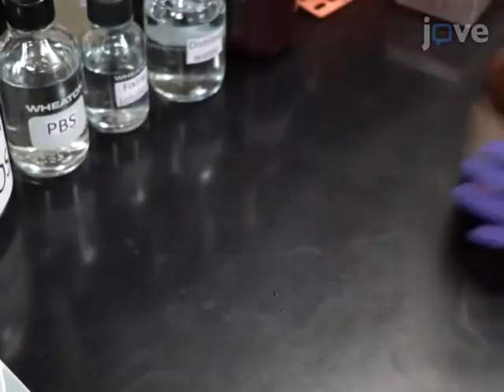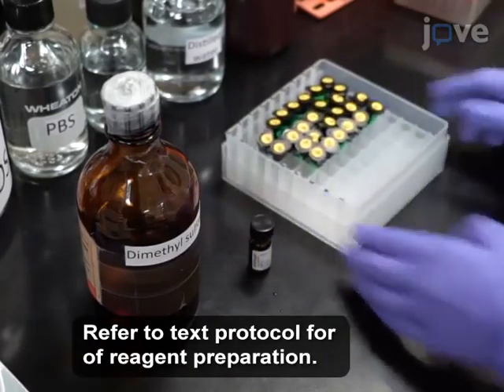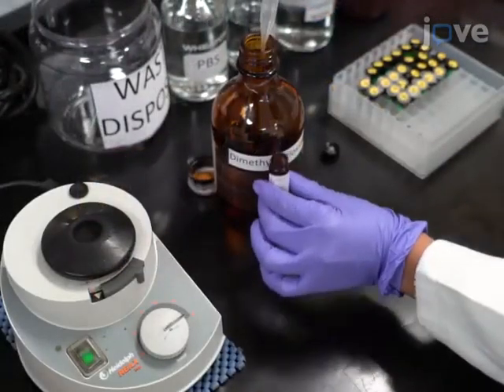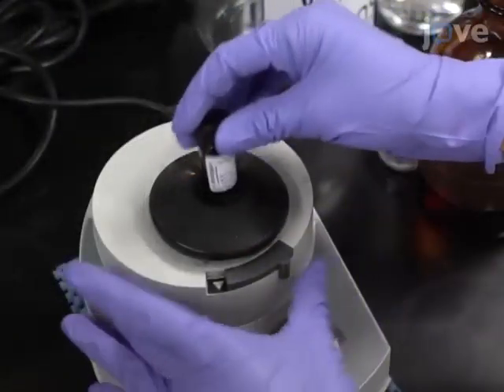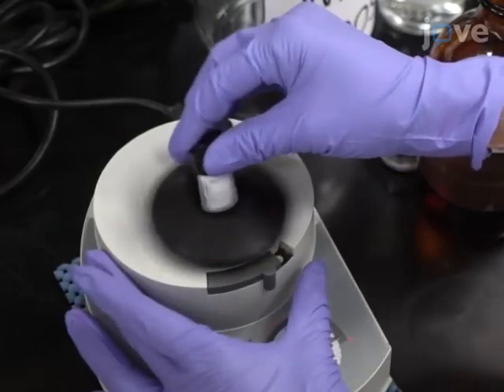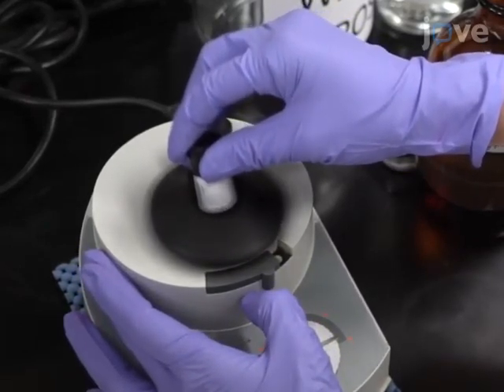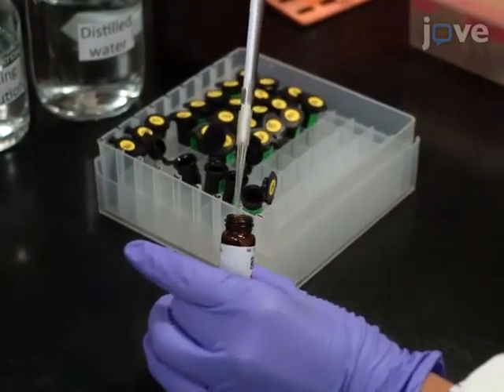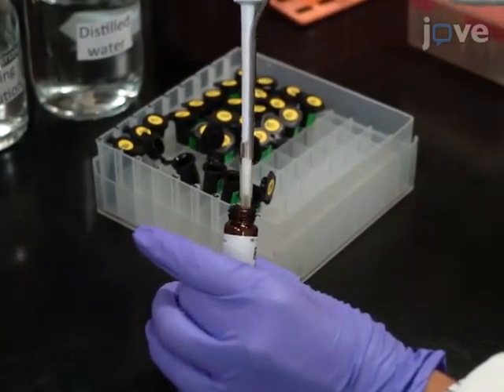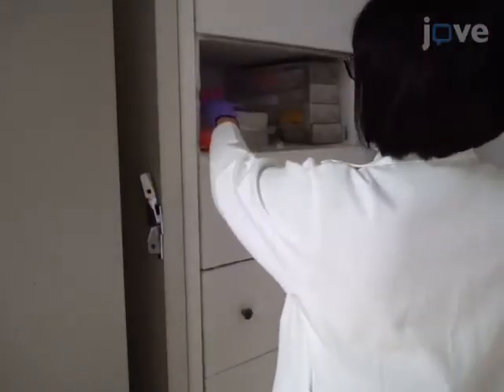The first step in this protocol is the preparation of the required buffers and solutions. To prepare a 10-millimolar BODIPY stock solution, dissolve 10 milligrams of BODIPY 493/503 in 3.8 milliliters of dimethyl sulfoxide. Divide into 100-microliter aliquots and keep in the dark at minus 70 degrees Celsius.